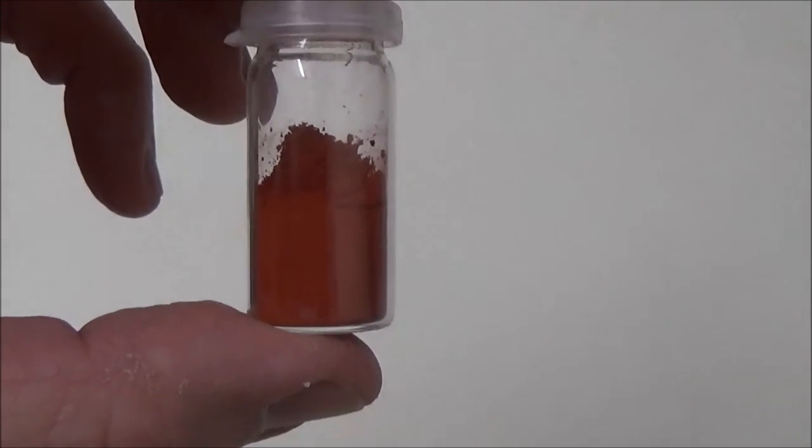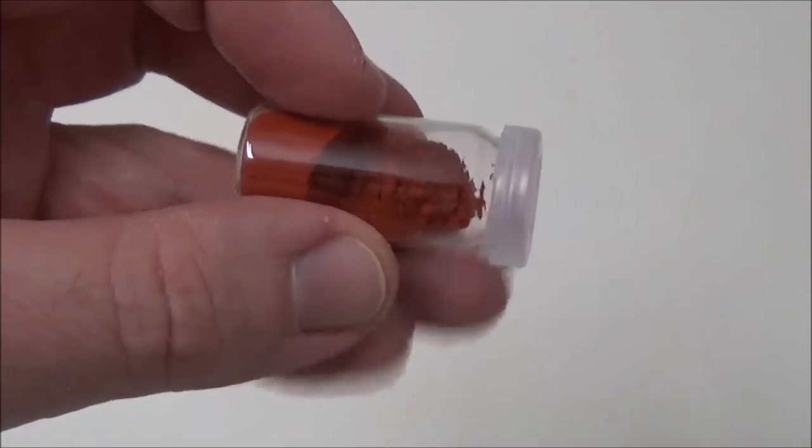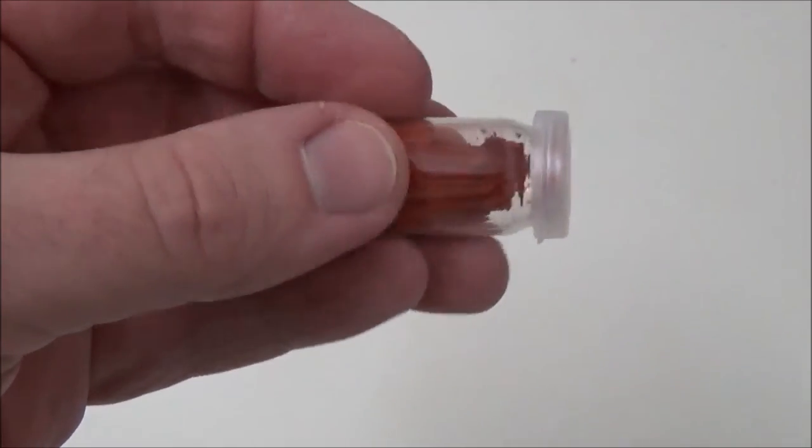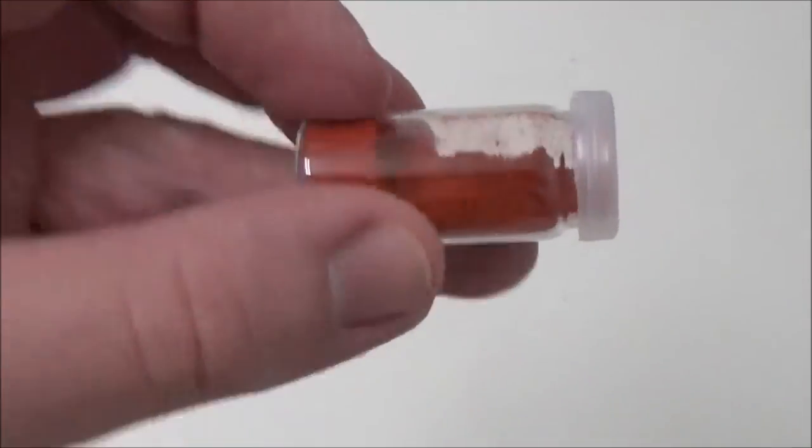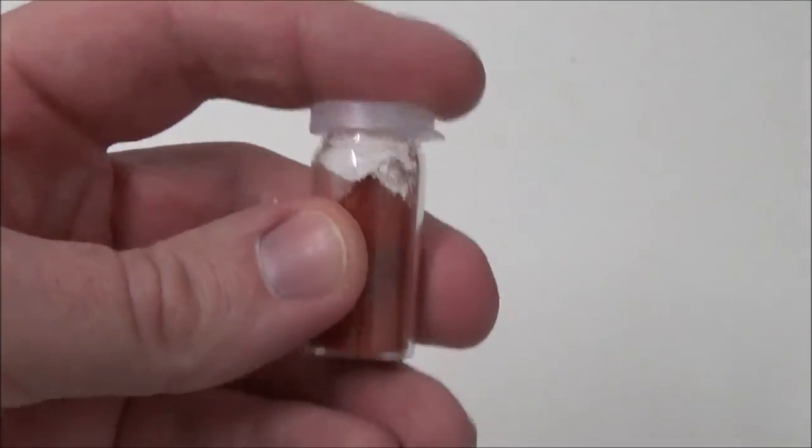Finally, we obtained 1.7 g of a dry red powder of pure fluorescein. This corresponds to a yield of 51.2% compared to the theoretical result, which should certainly be better on a larger scale and with a longer reaction time for the melt.